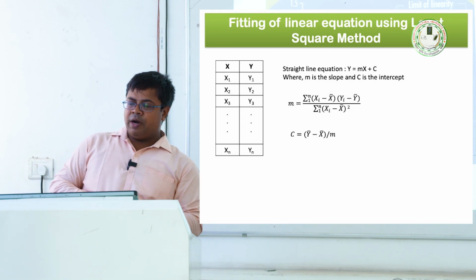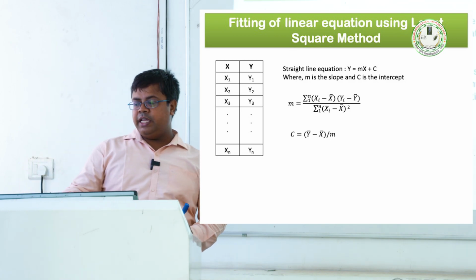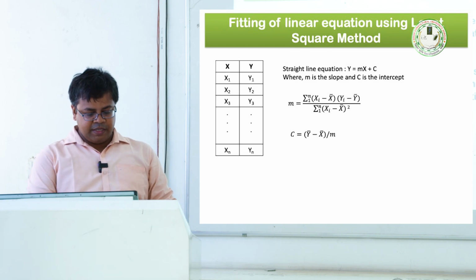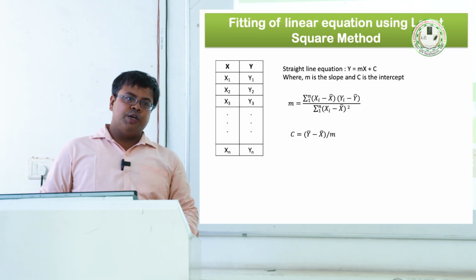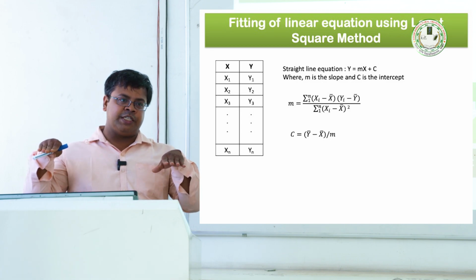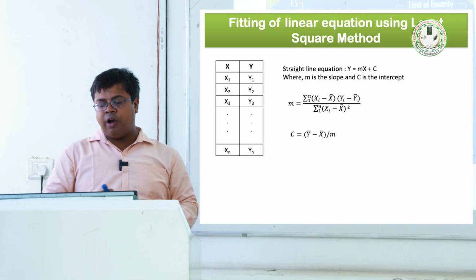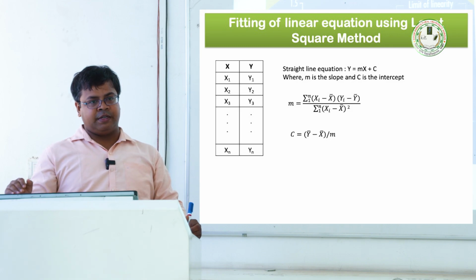Okay. Now one thing, in the introduction I told that this is used for the limit of detection. First point, most standard curves are straight line equations. Okay, means there will be a proportional increase. If the concentration increases, correspondingly the absorbance will increase.